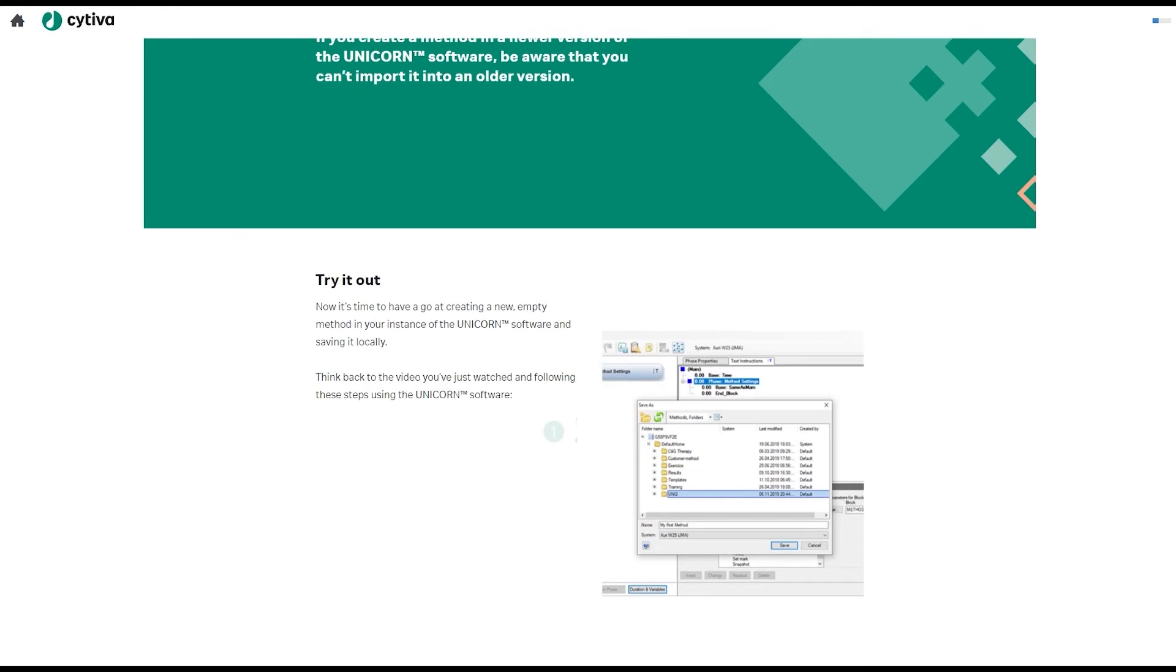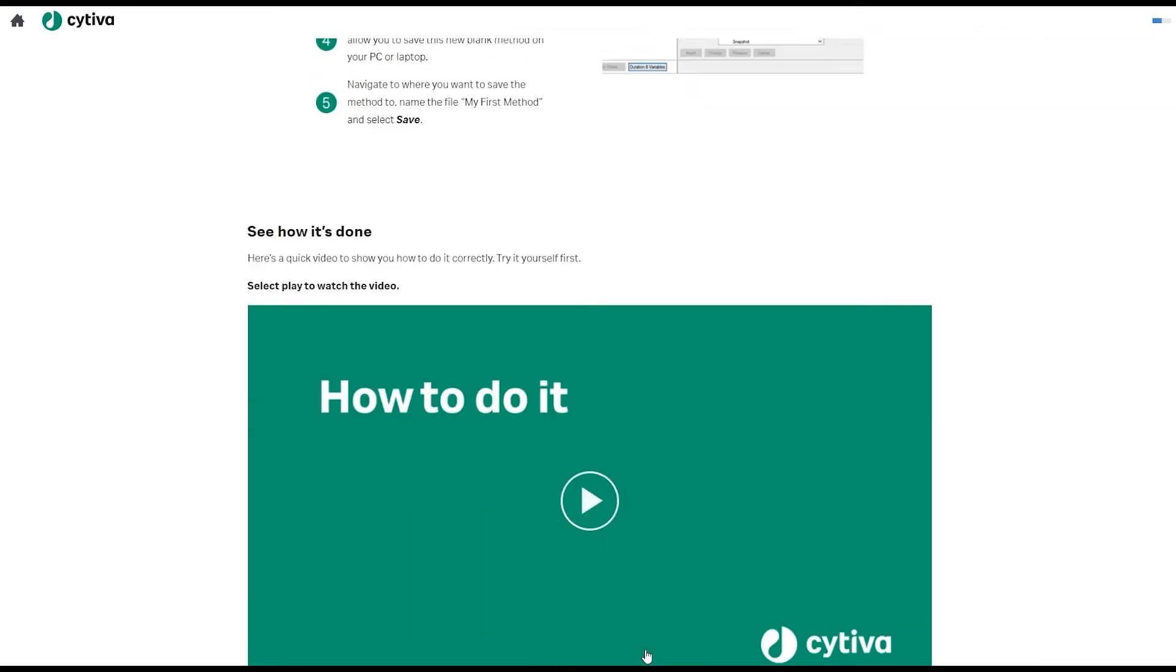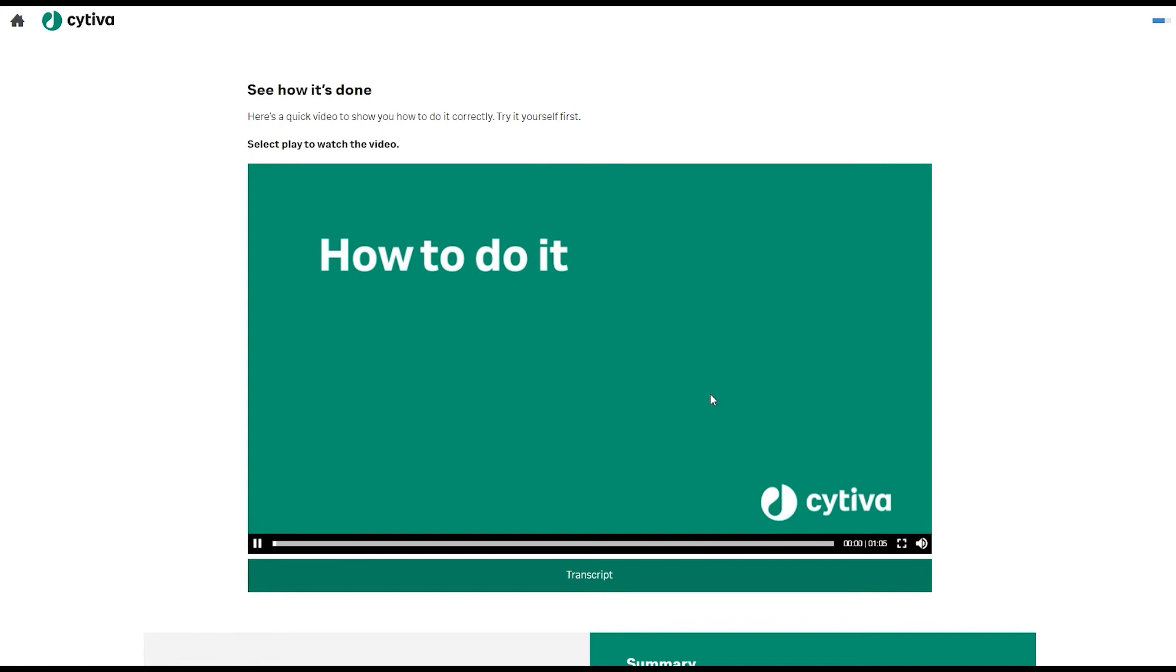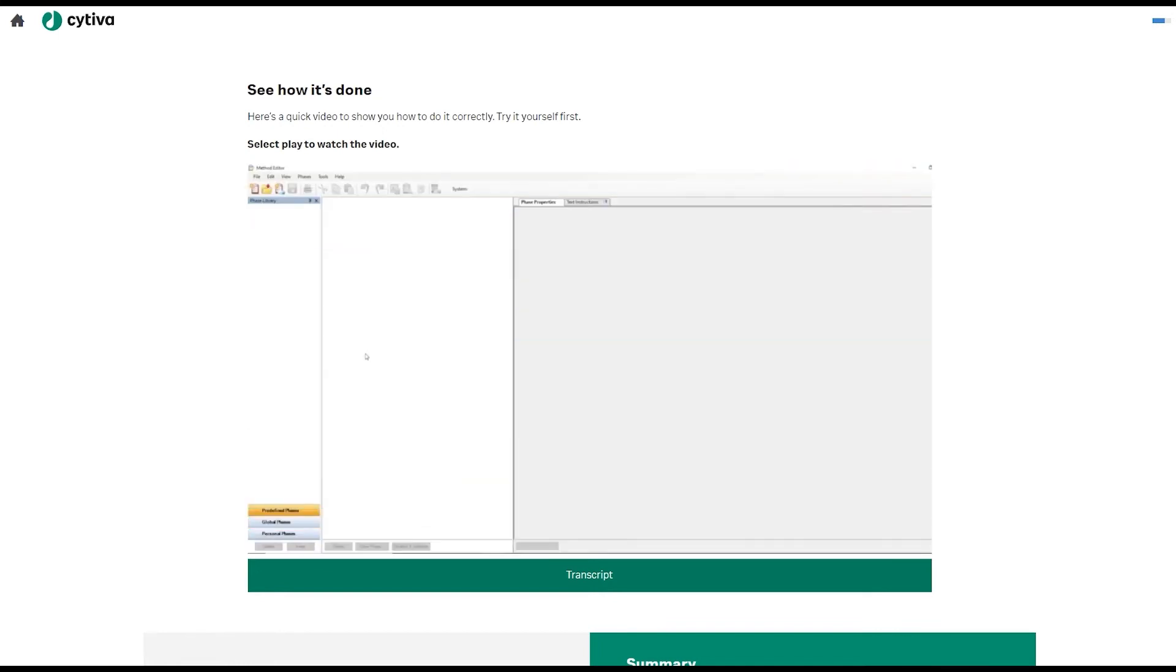As you work through the challenges, you'll be supported and guided every step of the way via structured feedback and explainer videos. In this video, we will walk through the steps to create and save a new method.